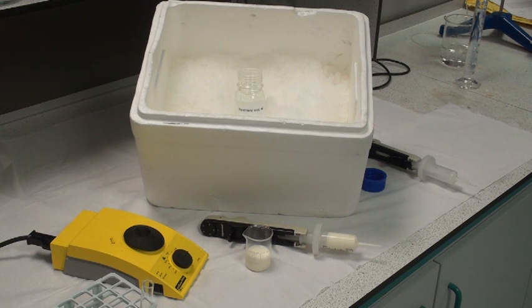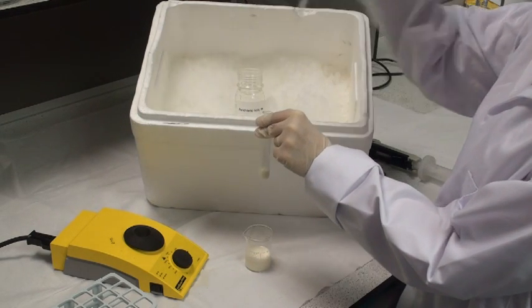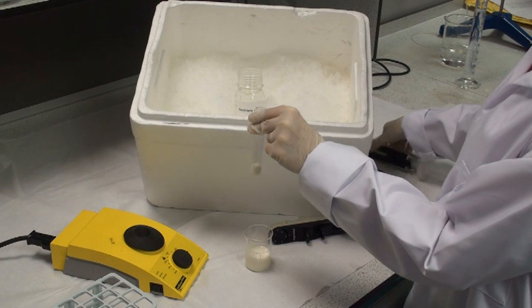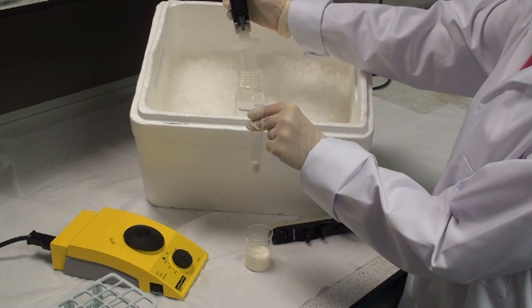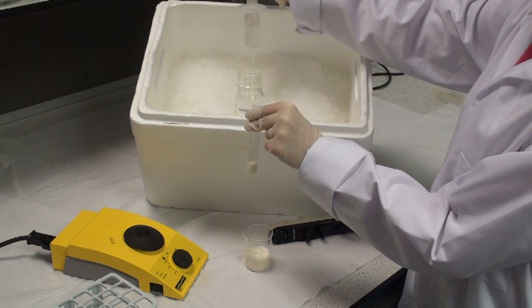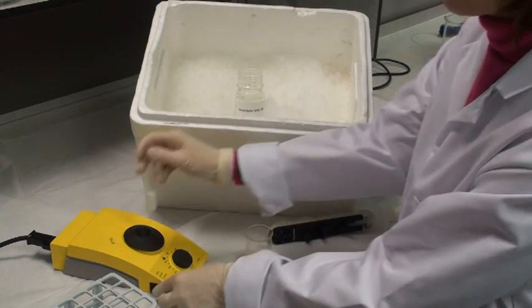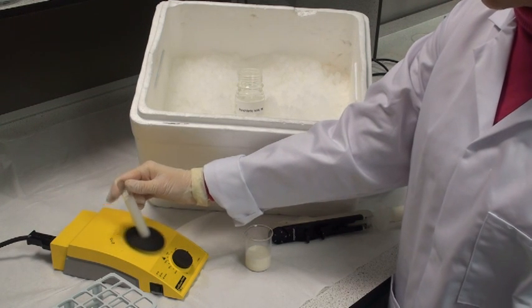Protein-containing samples such as milk, yoghurt, cream, serum, blood samples, or homogenised meat samples can be deproteinised with perchloric acid, as shown in the following example for milk. First, add 2 mLs of the sample to a test tube, then add 2 mLs of ice cold perchloric acid. Mix the contents of the tube vigorously on a vortex mixer for about 10 to 15 seconds.